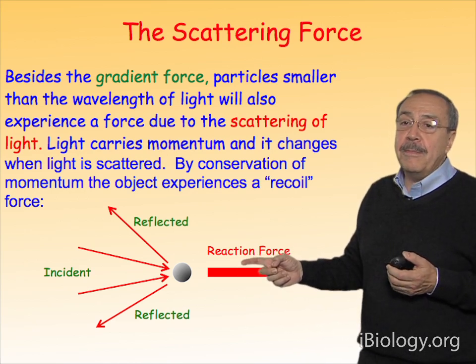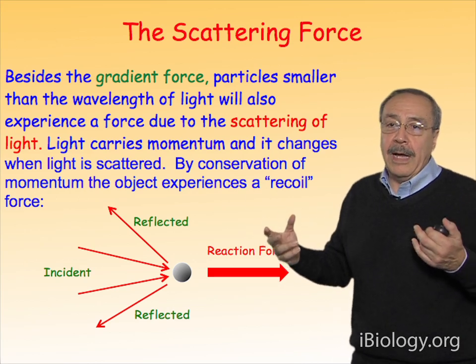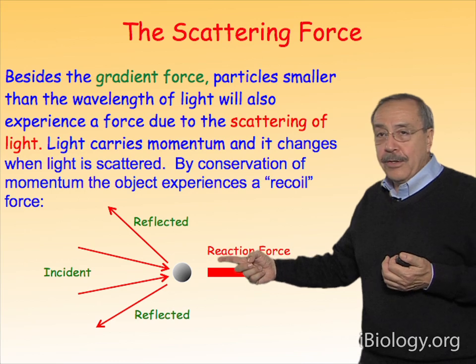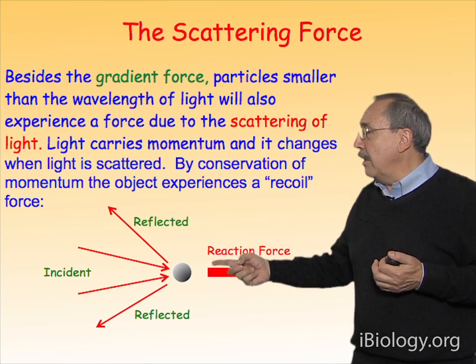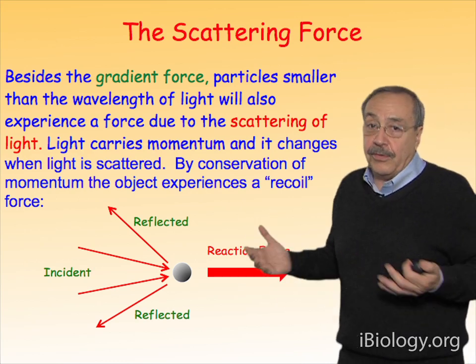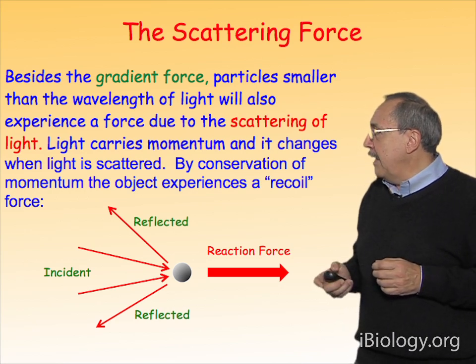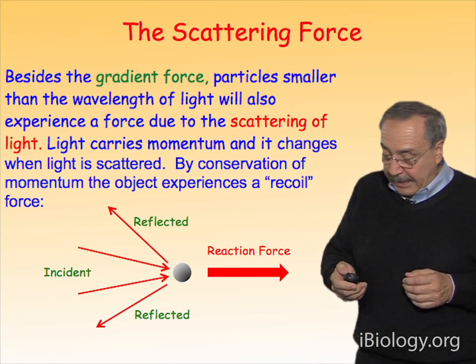Okay? So just imagine as if you are playing a game of pool, and you come with some ball that hits the white ball here with one angle, it gets reflected, and of course the other ball, the white ball, will actually move in the opposite direction because it's trying to conserve momentum. Okay, so this is therefore a reaction or recoil force that we must take into account as well.